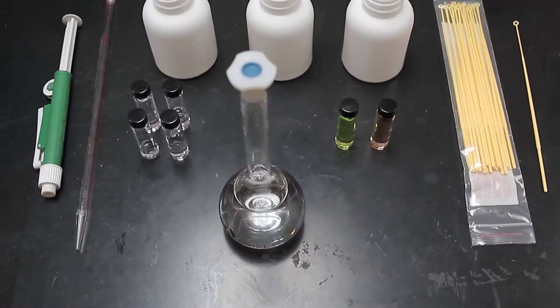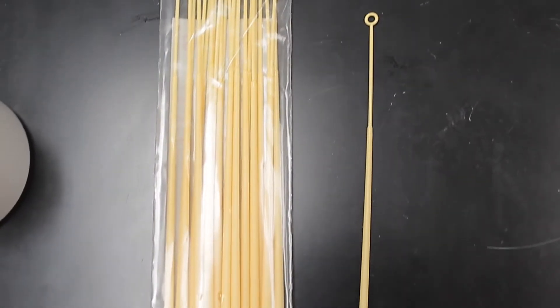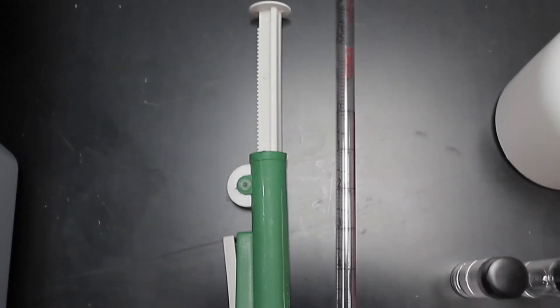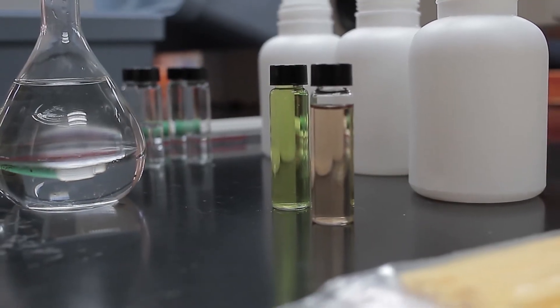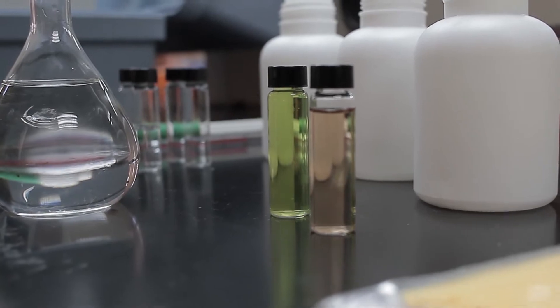For this test, you will need sterile tubes, disposable inoculation loops, an incubator, a pipette, lauryl tryptose broth, brilliant green bile broth, and EC medium broth.